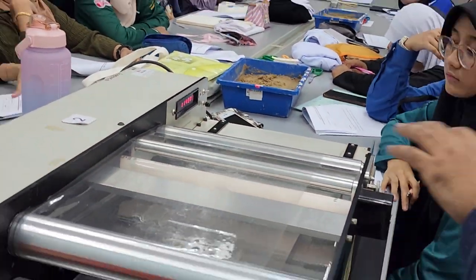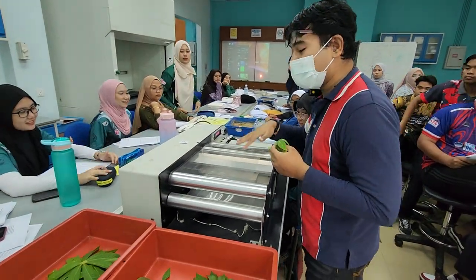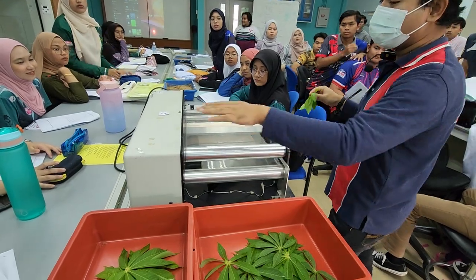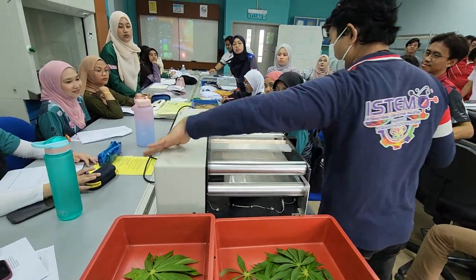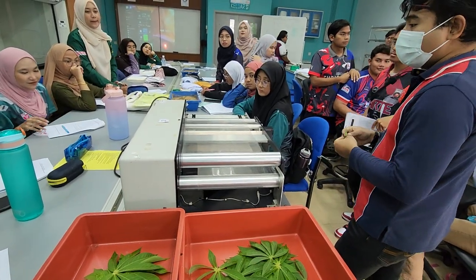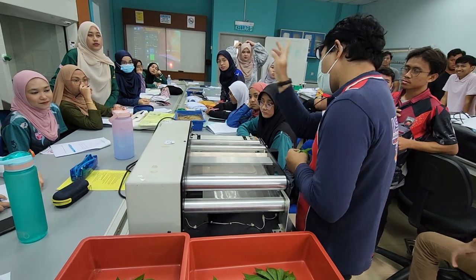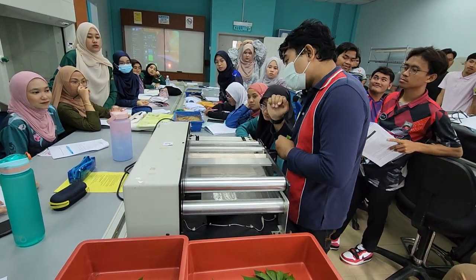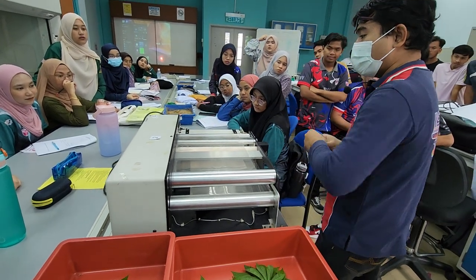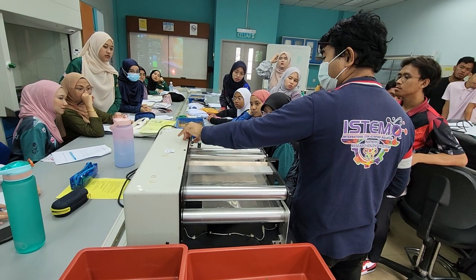Okay, number one, it's just a good practice. You need to clean up first, actually. But I think this is kind of okay. This machine is already like what? Older than you? Yes. We should be having a newer machine. Okay. Number one, you need to tare it. Tare it meaning you re-zero it. How do you re-zero? Reset this button here. But why won't it reset? Broken.